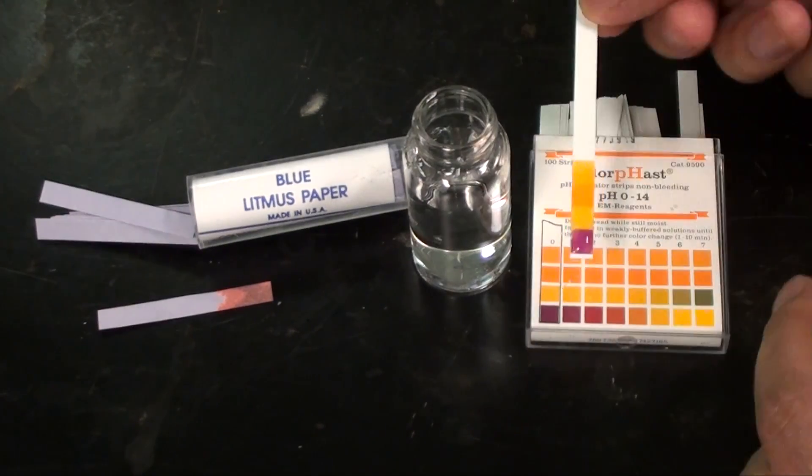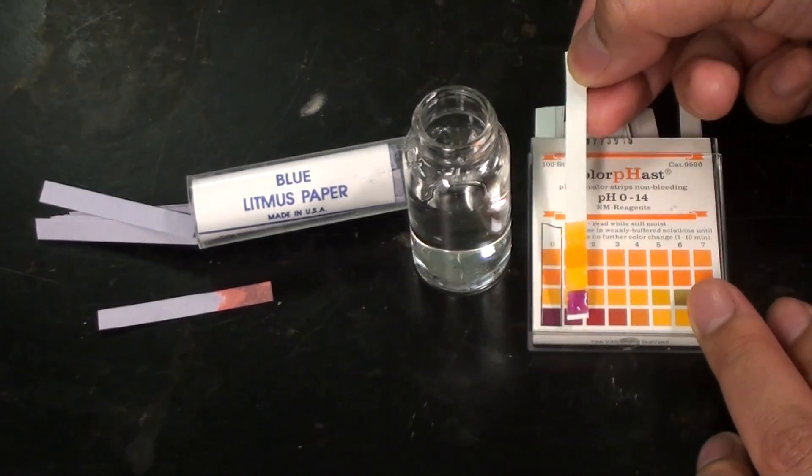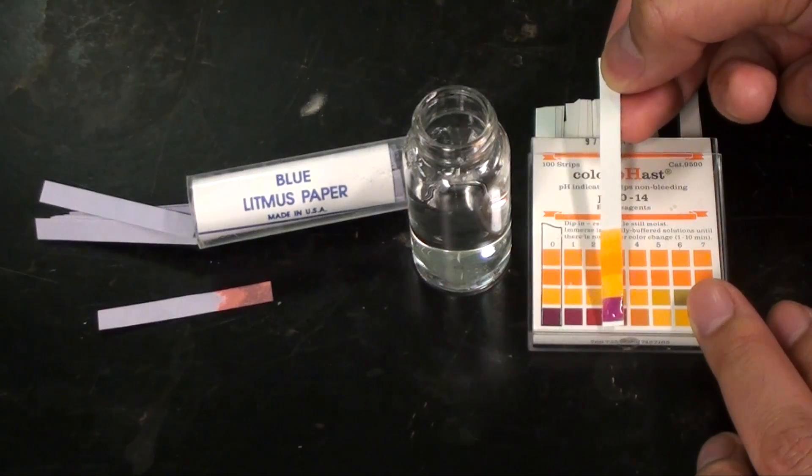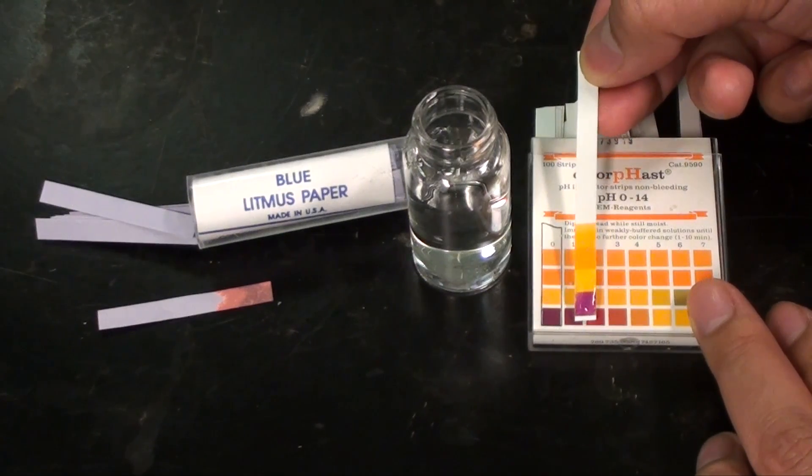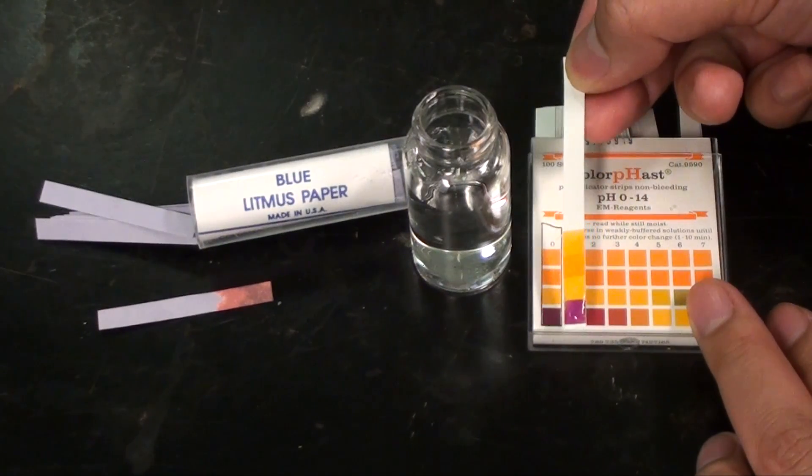Anyway, wait for the color change. And then compare the color to a reference chart to find the pH. For things like fieldwork and quick measurements, this is great.